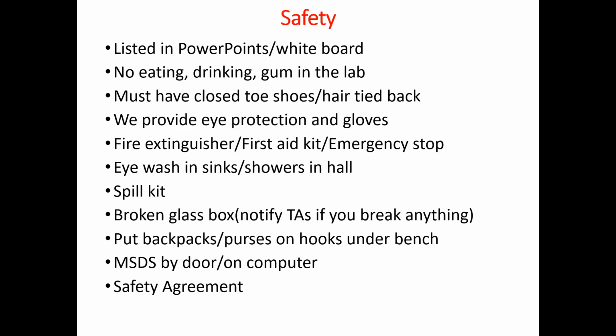You can put your backpacks and purses on the hook under the bench or simply sling them under. If the backpacks are beside your chair, it's a safety hazard and we tend to trip over them, especially in case of a fire. By the door, there's a yellow binder with the material safety data sheets for the chemicals that you work with. These are also on the computer. We've given you a copy of the safety agreement, so go ahead and sign that, documenting that you've been trained, and pass it to the TAs.